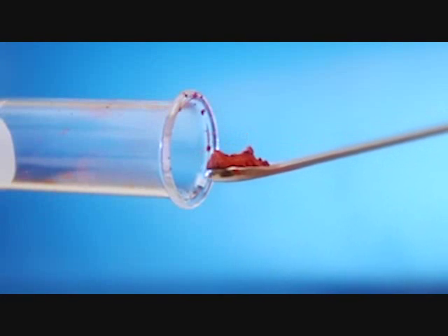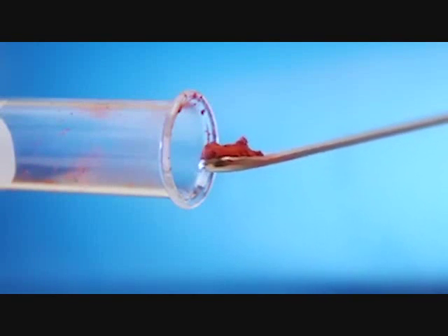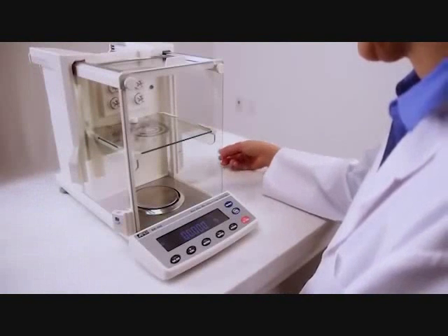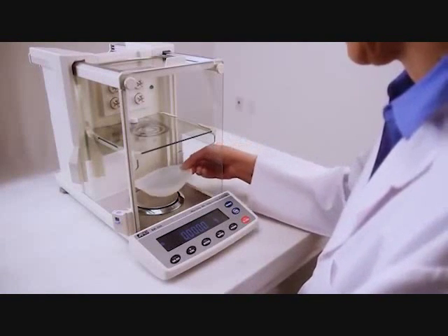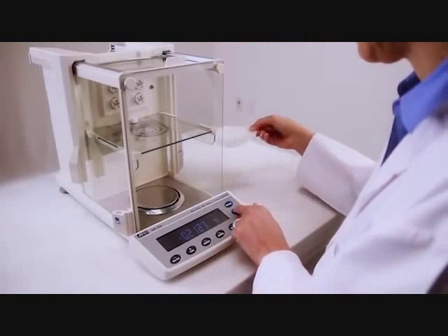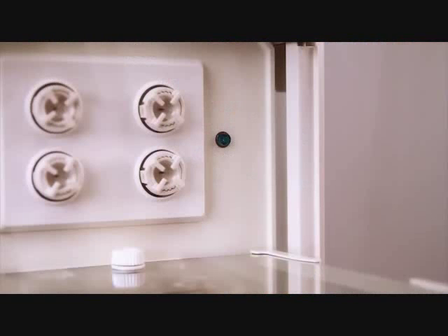Even laboratory glassware, not only plastic containers, can become charged just from normal handling, raising the risk of cross-contamination. The resulting static also makes weighing more difficult. Here, the display value is rapidly changing.